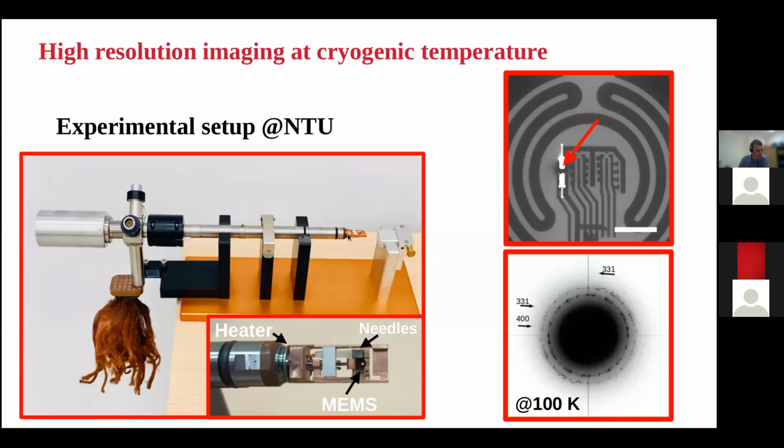At the time, like 4 or 5 years ago, it was a unique TEM holder that was not available anywhere else. And now there are maybe 3 to 4 of such holders worldwide. So it's still quite unique instrumentation. We have been able to obtain sub-angstrom resolution at 100 Kelvin.